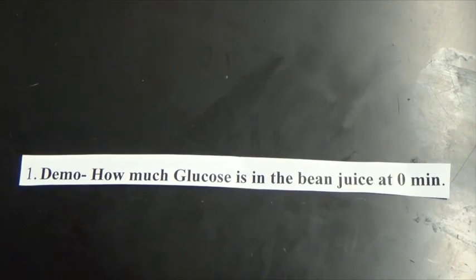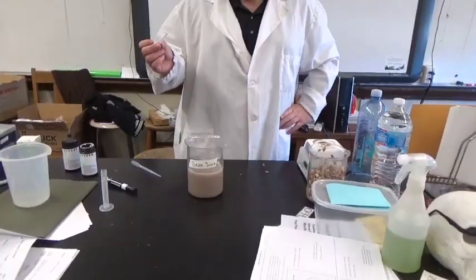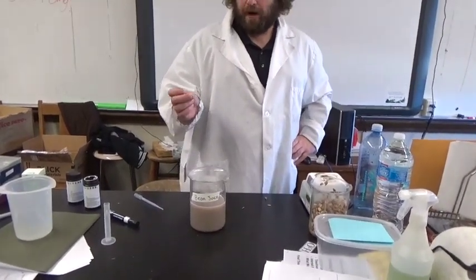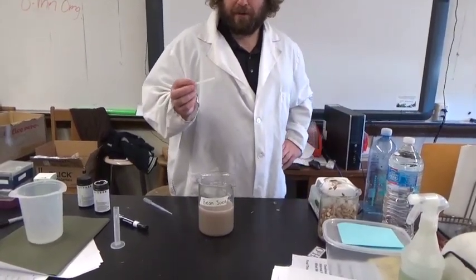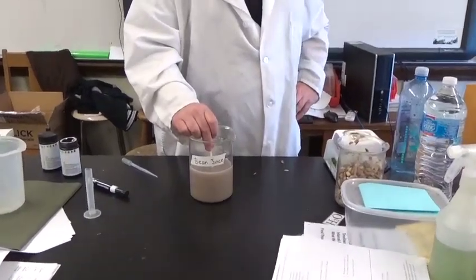Number one. Demo: How much glucose is in the bean juice at zero minutes? Everybody will be using the same bean juice, so rather than wasting a bunch of strips, I'm going to test the zero-minute bean juice for everybody. I'm going to dip it in for 15 seconds.